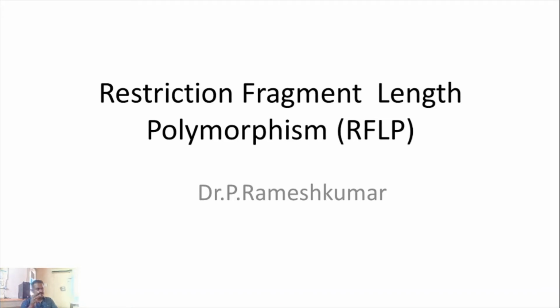So classification of these techniques is based on the PCR. RFLP is a non-PCR based technique. Please keep in mind, RFLP is a non-PCR based technique. The remaining two, RAPD and AFLP, are both PCR based techniques. So this technique alone is the non-PCR based technique. We will learn what the problems are and how to do the techniques, one by one.